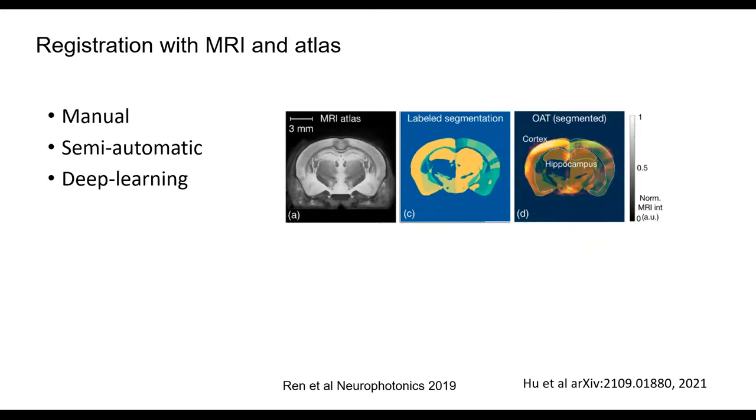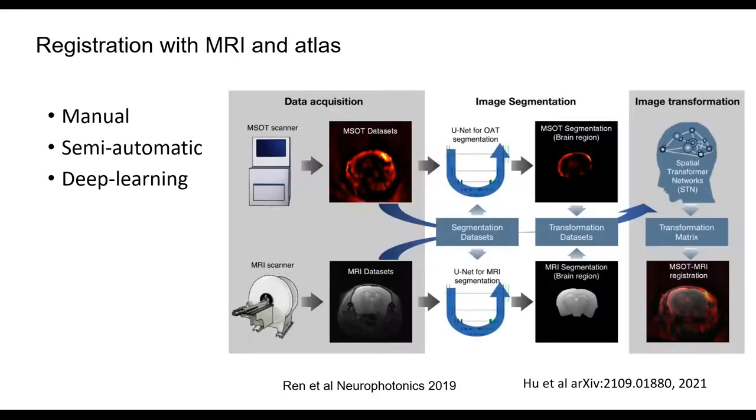Another thing I want to mention is about the registration. Previously, we developed a semi-automatic tool to register between the MRI and the optoacoustic image to enable better region of interest quantification. Recently, there is also a deep learning-based method developed, which provides automatic registration without manual input.